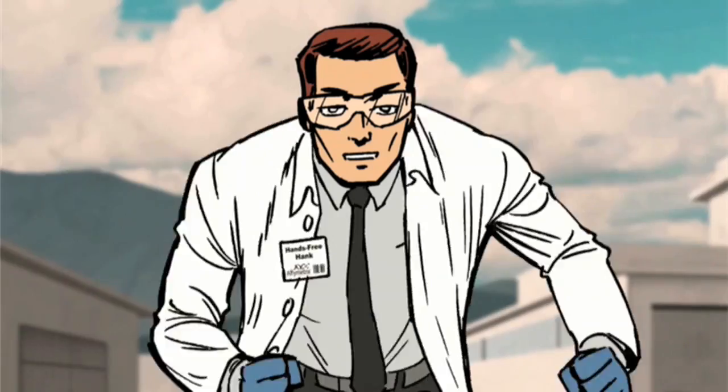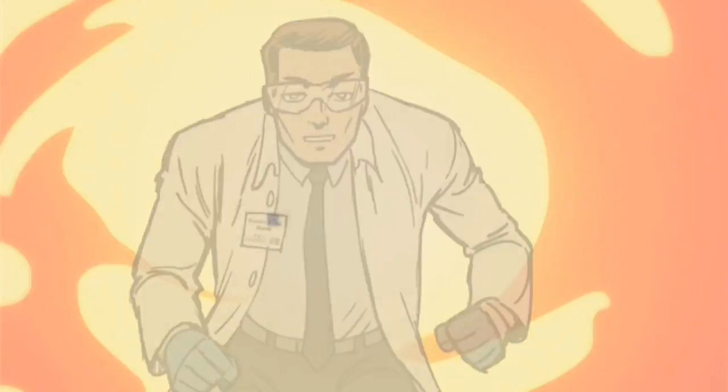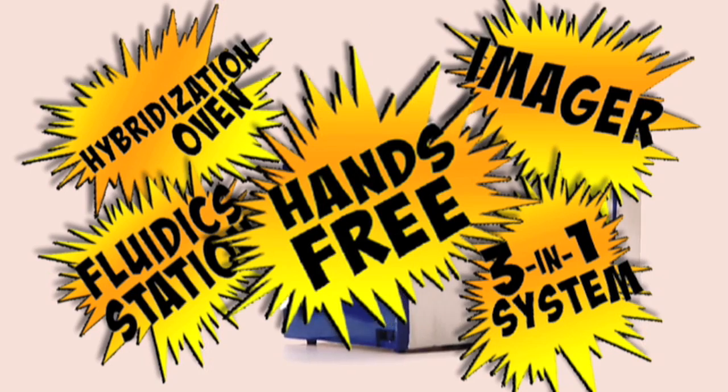The first hands-free microarray processor — Gene Titan! It's the all-new Gene Titan instrument from Affymetrix: hybridization oven, fluidics station and state-of-the-art imager. It's a three-in-one system with hands-free operation.